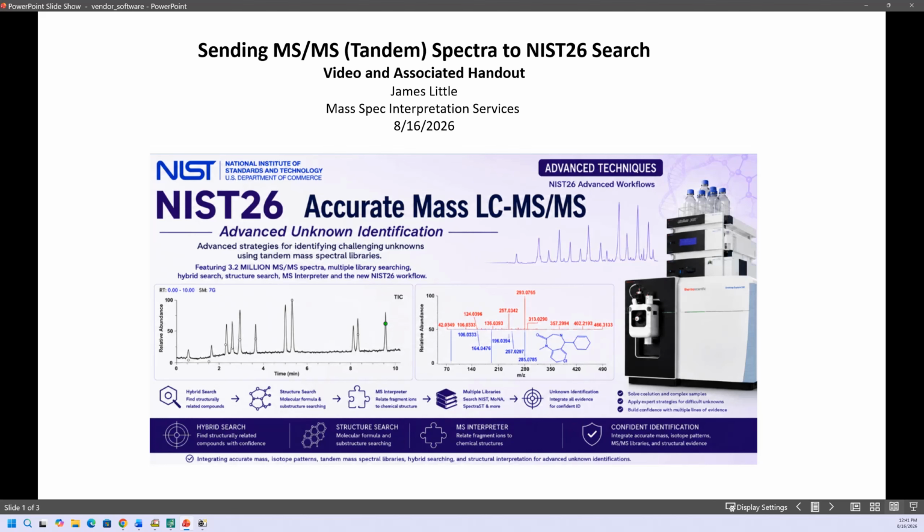This video and associated handout is about sending MS/MS tandem spectra to the NIST26 search, and is part of a larger series of the NIST26 search capabilities, which can be found on my website.